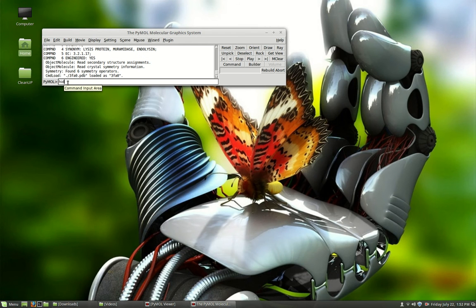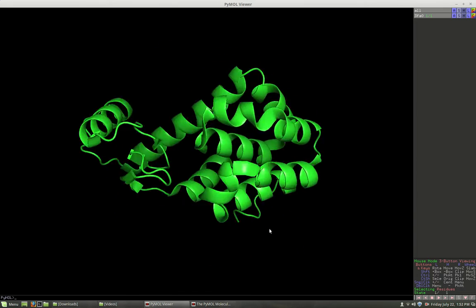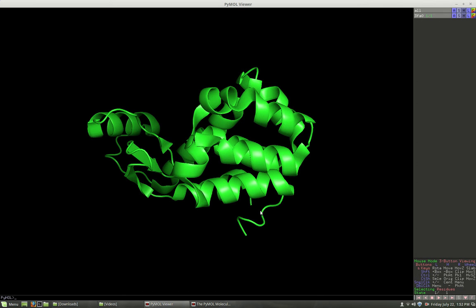So I'm going to go hide everything, and then I'm going to go show cartoon. Enter. Now let's see what that did to our viewer. And this, of course, is what we're used to with our cartoon model.